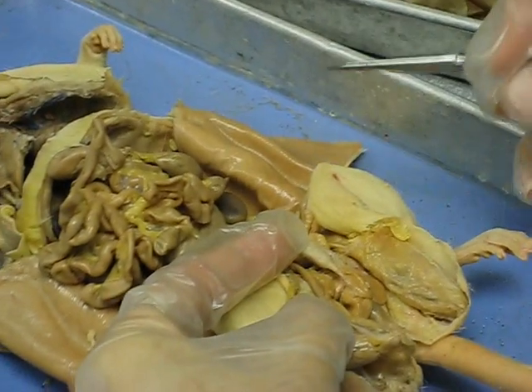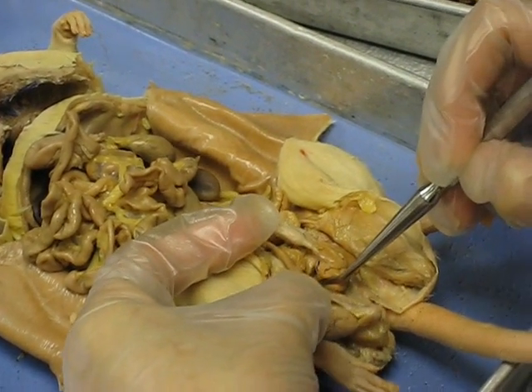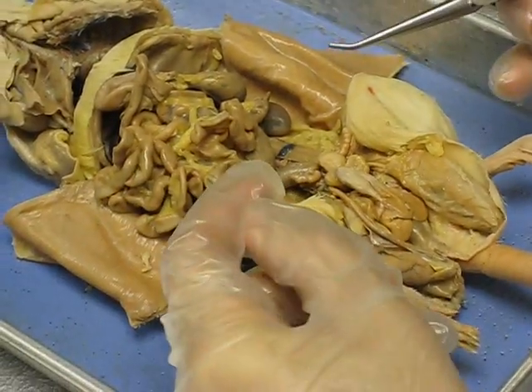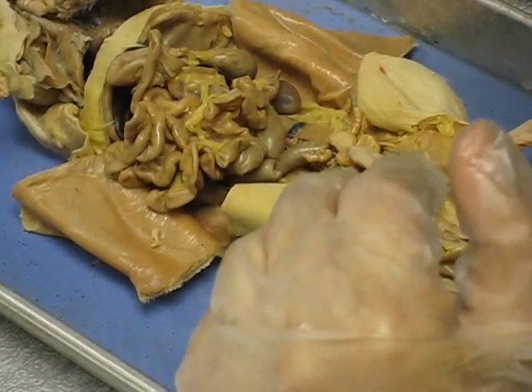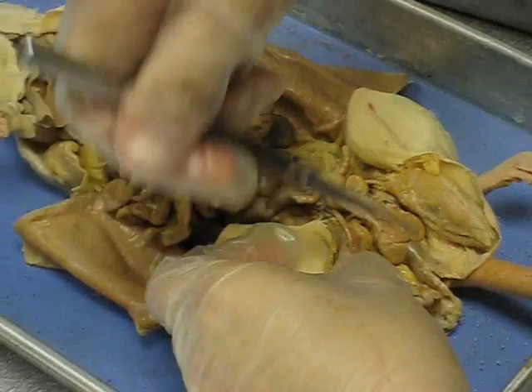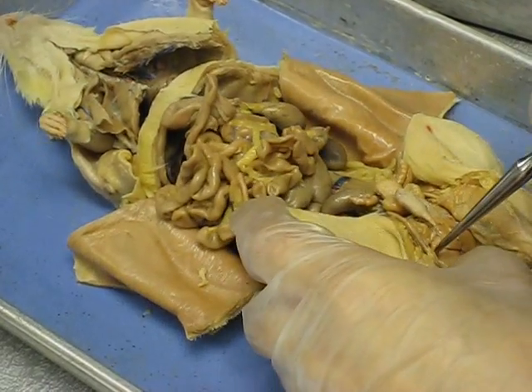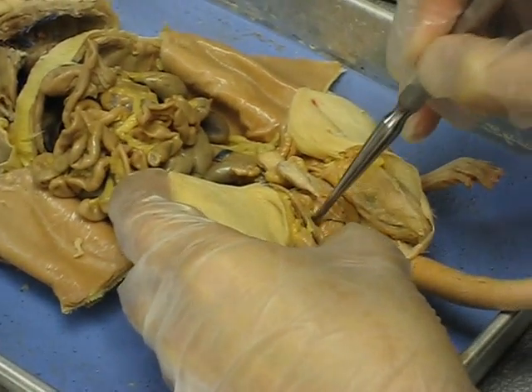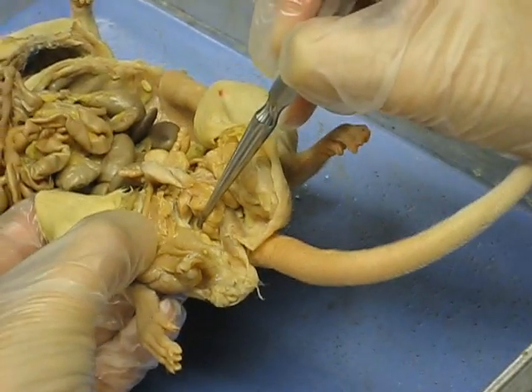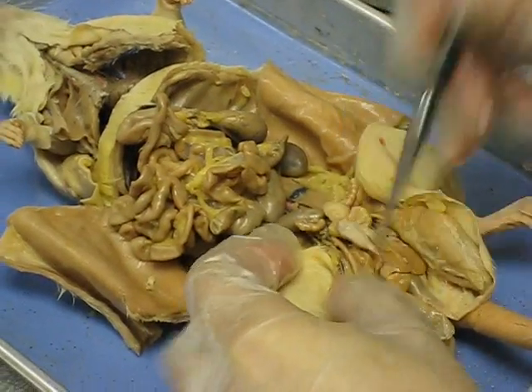So how are you going to point this out during the practical? It'll be cleaned up and moved away so you'll be able to see it clearly — it's going to be out there for you. It won't be hidden in the back with a pin way in the back; it'll be nice and in view. So again, that's the bulbourethral gland — it looks like a little white egg in there.